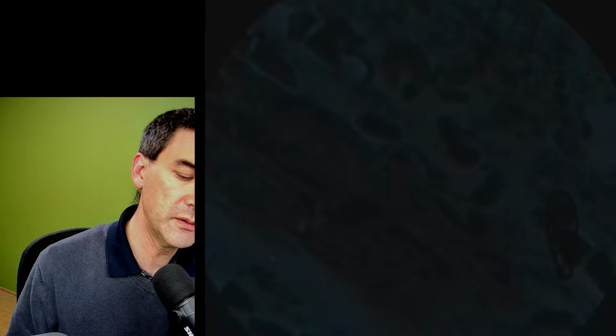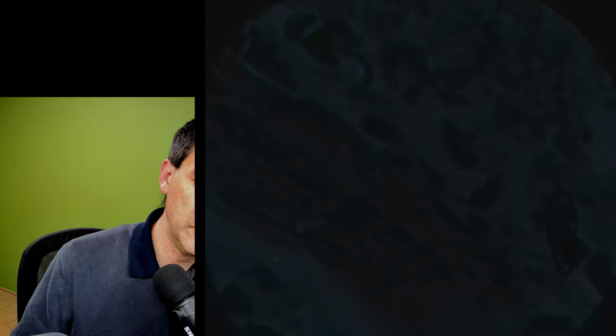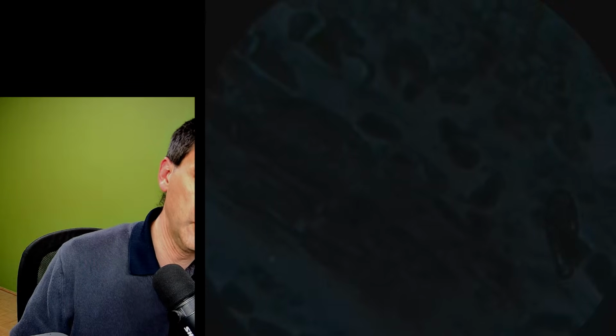Let me check. Because I locked the exposure, so that the... Here we go. Why does it not? Okay, here we go.